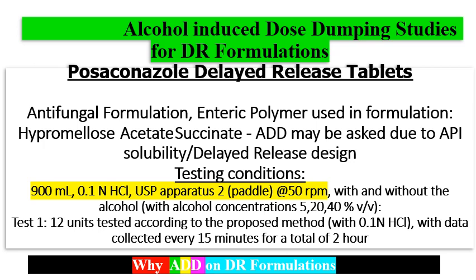This is an antifungal formulation, and the enteric polymer used in this formulation is hypromellose acetate succinate. Hypromellose acetate succinate has limited solubility in alcohol. So an alcohol dose dumping study may be asked due to API solubility or to support the delayed release design.